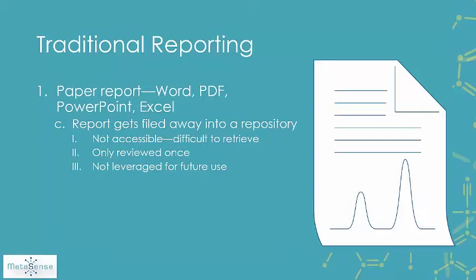Last but not least, this information may not get leveraged for future use. So again, if you're a synthetic or a medicinal chemist, they may not be able to view this information in the future, whereas they may use this information to direct their synthesis for future studies. So again, it's not really leveraged.